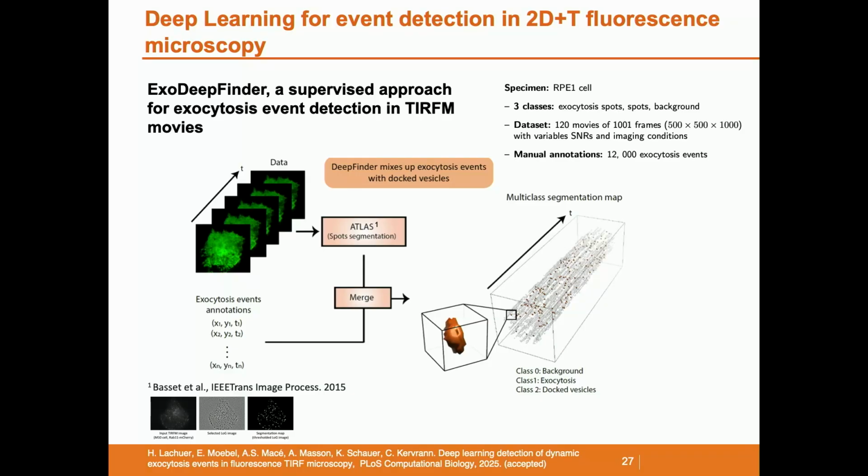For instance, to detect proteasomes, if you train a system to detect only proteasomes, you never find proteasomes in a cryotomogram. But if you train a system to detect ribosomes and proteasomes, you detect proteasomes. And here we did the same thing. So the second class is spot classes.